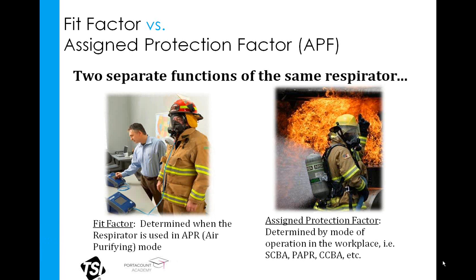However, when the same fireman comes in for his annual fit testing, he's going to be wearing the same respirator, but he's simply going to have a P100 filter. Now, this mode of operation for the respirator is referred to as APR, or air purifying mode. It can also be called negative pressure mode. So all fit testing is done with the respirator in this mode of operation, which is how the fit factor is derived. So again, I just stress that assigned protection factor and fit factor are two different values, and they're not necessarily related.